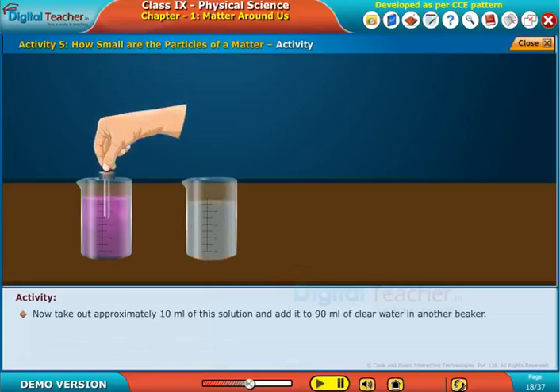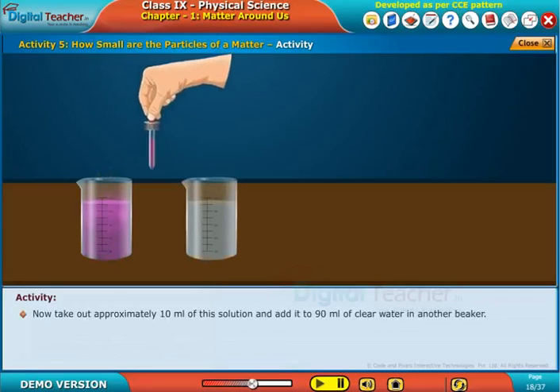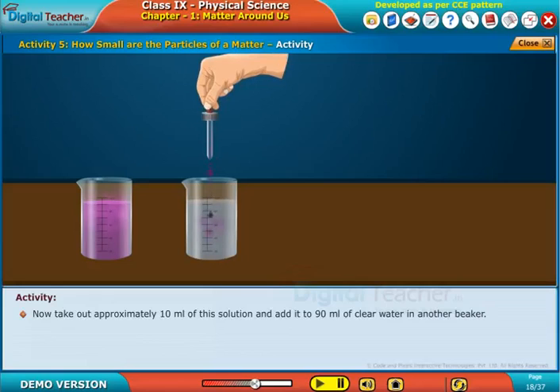Now, take out approximately 10 ml of this solution and add it to 90 ml of clear water in another beaker.